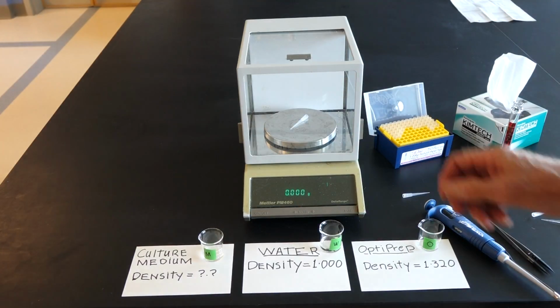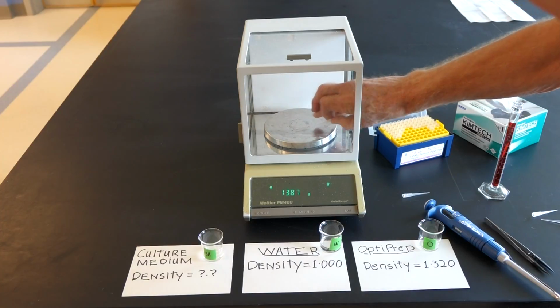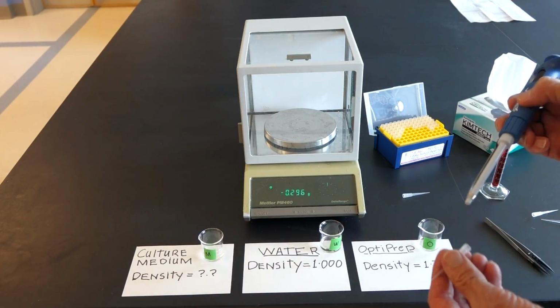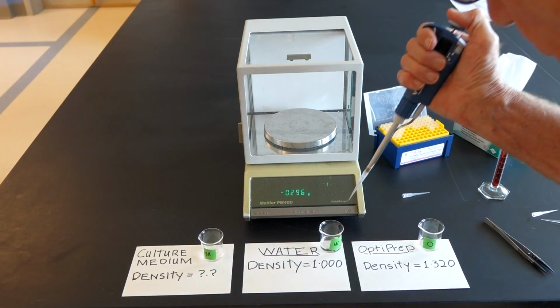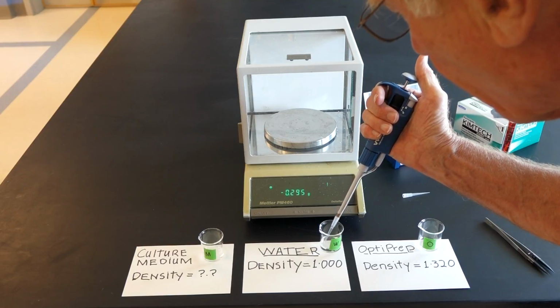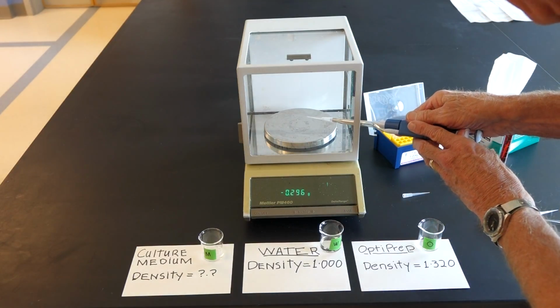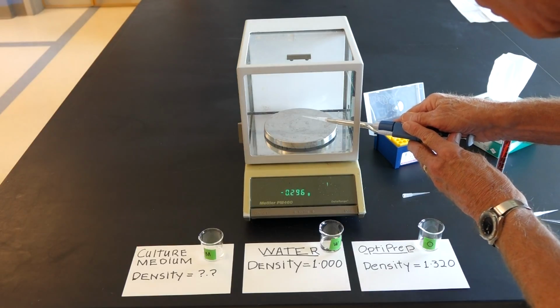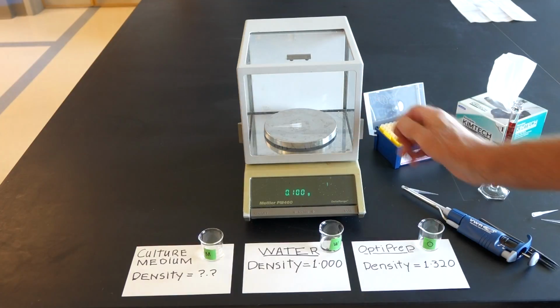It's tared to zero. Then I take my tared micropipette tip, place it back on the micropipette, and pick up exactly 100 microliters of the liquid that I want to measure. I eject it directly onto the pan, the whole tip. There it is. Then I can weigh it.